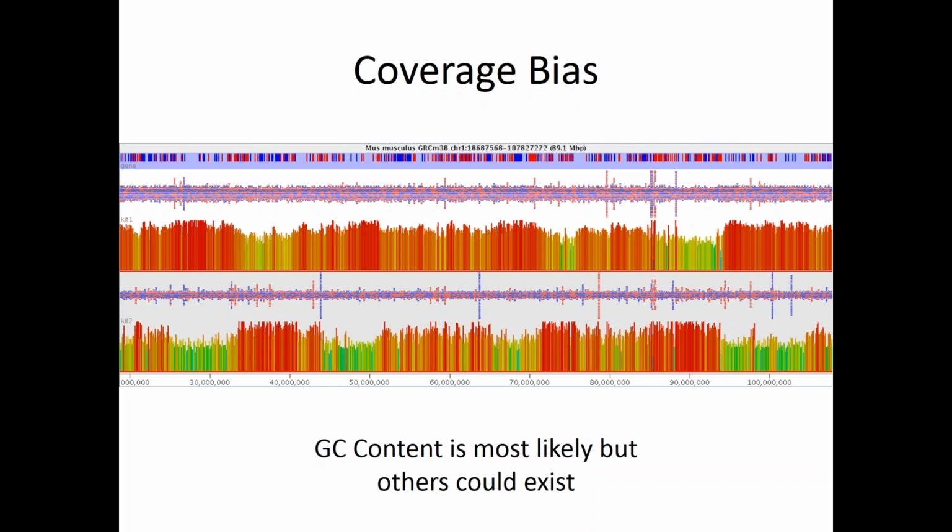The bars in here go up and down a bit, not hugely, but they do go up and down. But we sequenced this same sample with 2 different bisulfite kits, just from different manufacturers. What you can see in this case is that the sequence biases that we get, so the places where we have high coverage in kit 1, are actually the places with the lowest coverage in kit 2. If you're just using the same kit for everything, it's not so bad because the biases tend to be consistent. But if you're comparing between kits, then you want to really understand this, because those biases might lead you to make false predictions of differences that actually just arise from the selection biases from the kits. So all of this is really about understanding and being comfortable with what the data looks like.